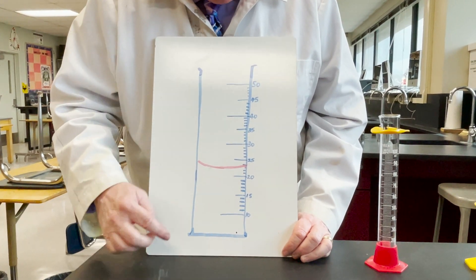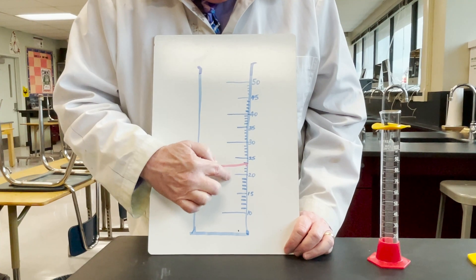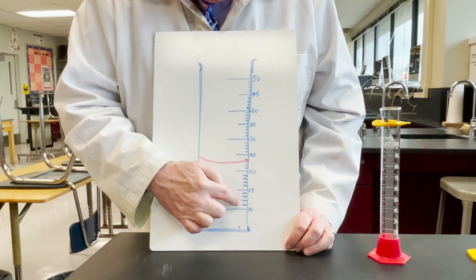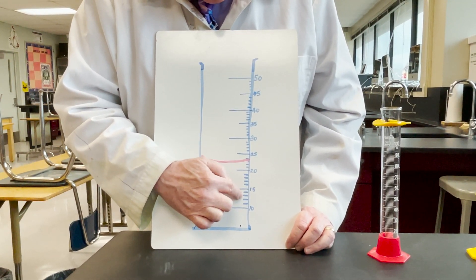So how do you read this? You see the 10, 15, 20, 25, 30, and then between the 10 and the 15 there are four lines, so that would be 11, 12, 13, 14.